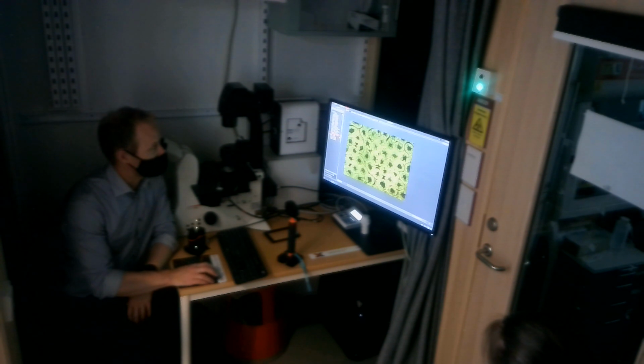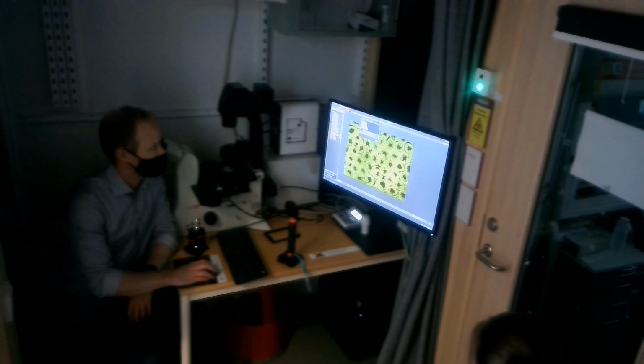One nice thing here, so this is the mosaic merge tab. Again, in here it's a viewer, so you can merge it again. You can also turn on and off the different channels. You can also adjust the scaling of it and so on. So you can do a lot of things in the viewer here.